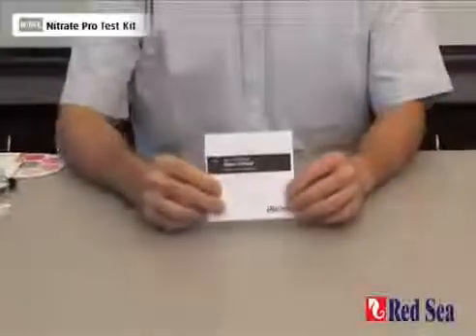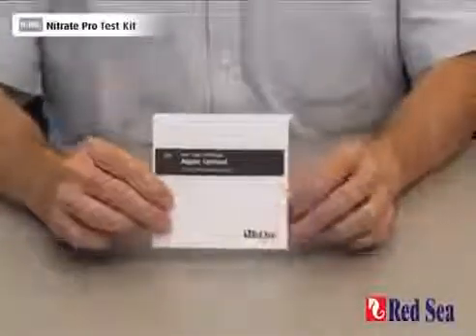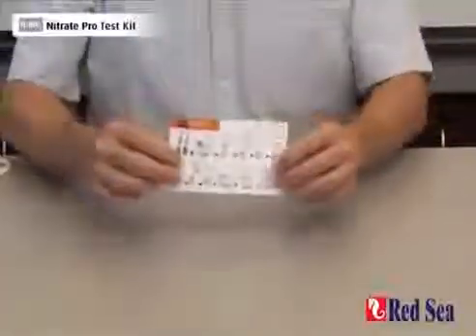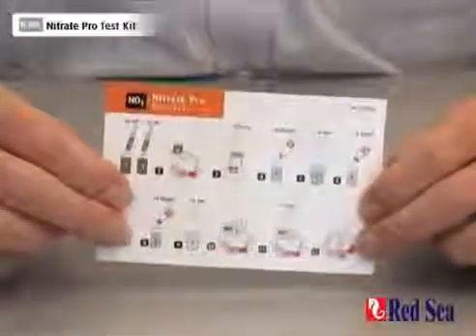Before doing the test for the first time, read the detailed instructions in the manual provided with the kit. There is also a set of easy-to-follow graphic instructions for when you're actually performing the test.